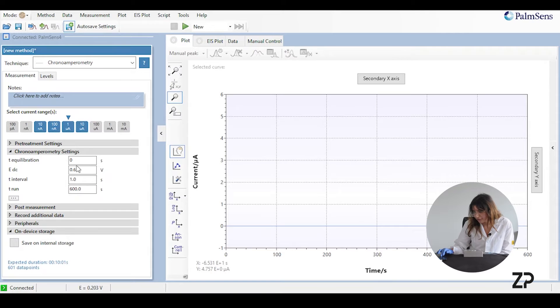The equilibration time is 0 seconds. The potential we're running at is 0.65 volts. The interval time is 1 second, and the running time depends on the user, but we recommend a minimum running time of 600 seconds.